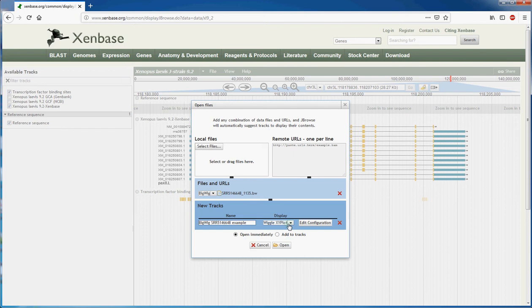You can change what type of plot it's drawn in. XY plot is usually the standard plot for bigwigs. Density can show it in a different way as opposed to a graph. You can show which areas of the graph are strongest and weakest by showing a density plot. And there are various other ways of displaying it, but this is the default and usually works best.